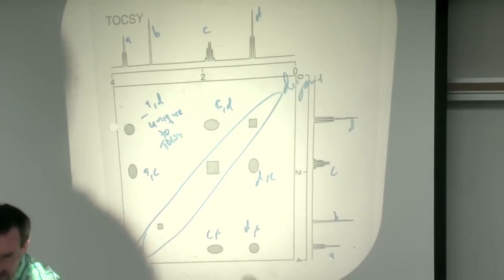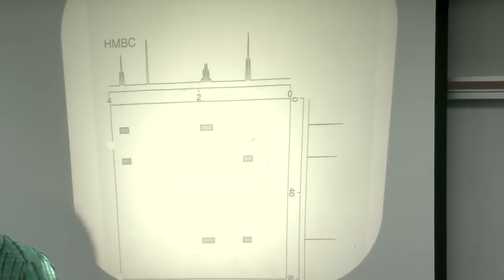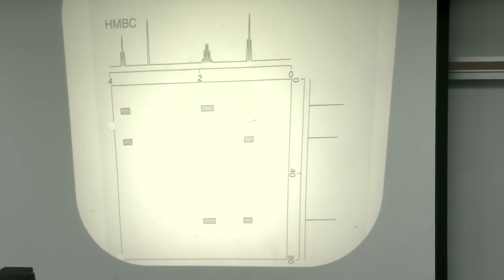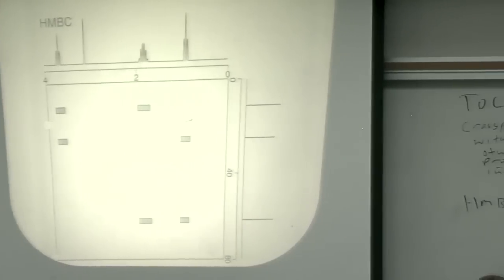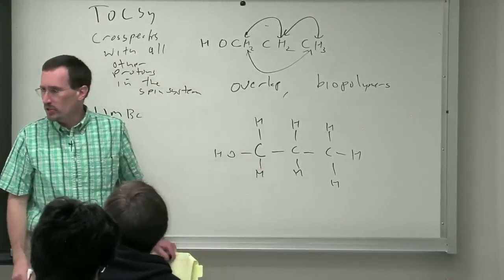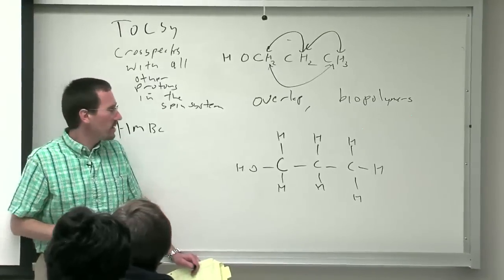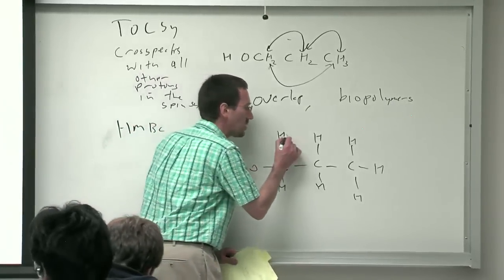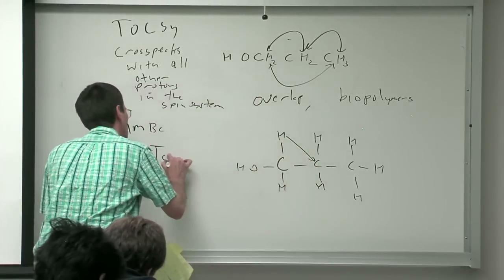Heteronuclear, right. You don't have a diagonal. You don't have this element of symmetry. All right, the last one in our schematic, now we come to our HMBC. And let me again sort of show you in my simple-minded view on the blackboard here. So again, we'll come back to our molecule. HMBC can be drinking from a fire hose. There's a ton of information there. And what you end up needing to do is use it in a very focused fashion because you'll just drown in peaks. So remember, HMQC was our one bond CH couplings. In HMBC, we get two and three bond CH couplings.